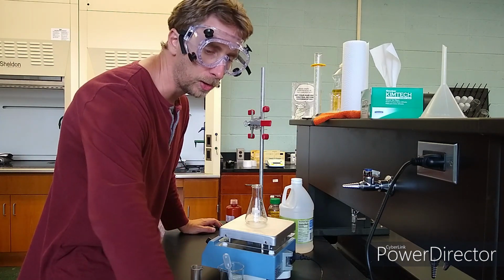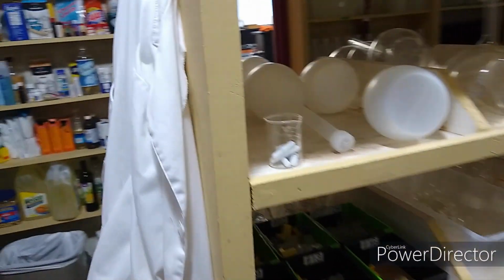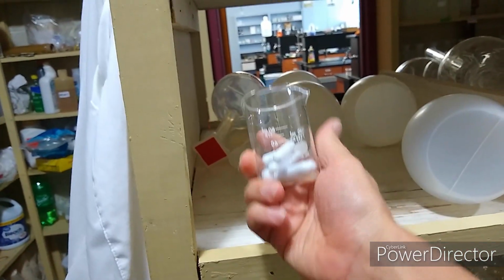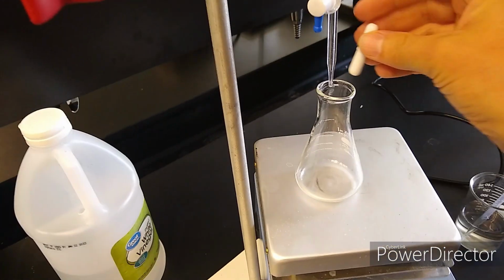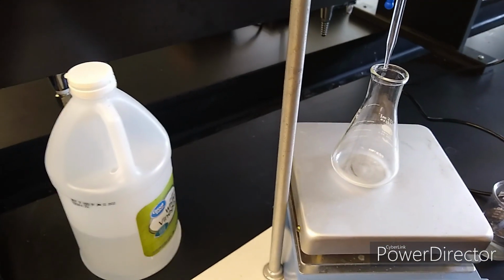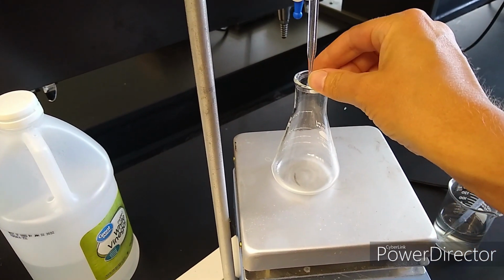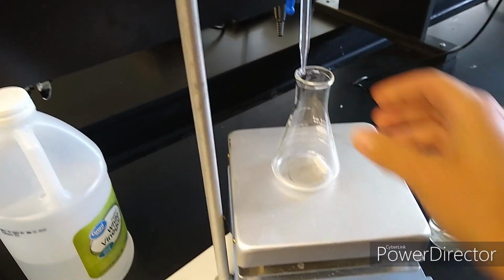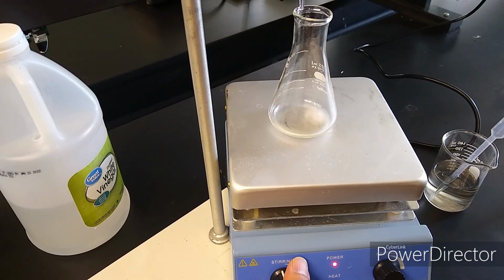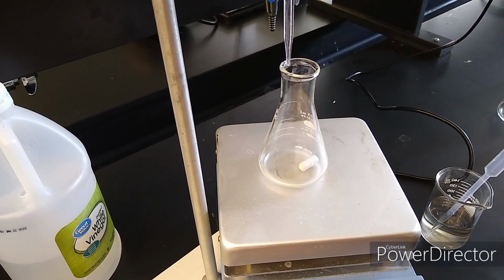Where are the stir bars? I need the magnetic stir bars. Well, here's an inconspicuous place for magnetic stir bars in the stock room. Now watch and be amazed at the power of the stir bar. Oh, that's a big one. I don't need one that big. You know, it's the simple things that can really impress people sometimes.